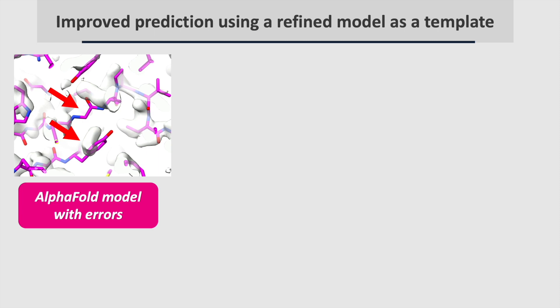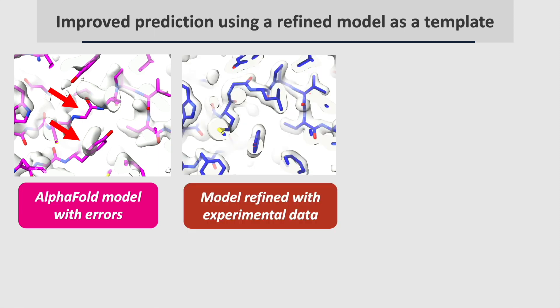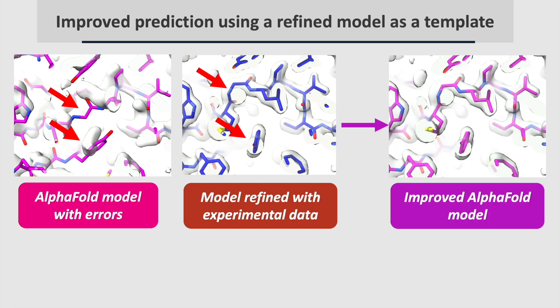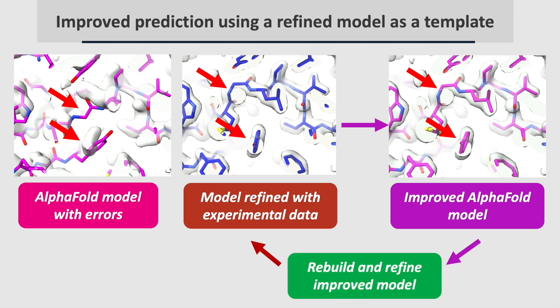An exciting aspect of AlphaFold prediction is that it can be improved by using accurate models as templates. Here is part of an AlphaFold model that does not match an experimental density map. A rebuilt and refined model is much better. Using this refined model as a template in prediction yields an improved AlphaFold model. The new prediction can be used in additional cycles to improve both the model and the map.